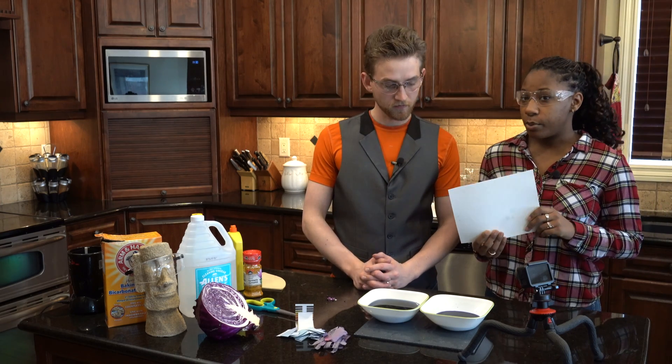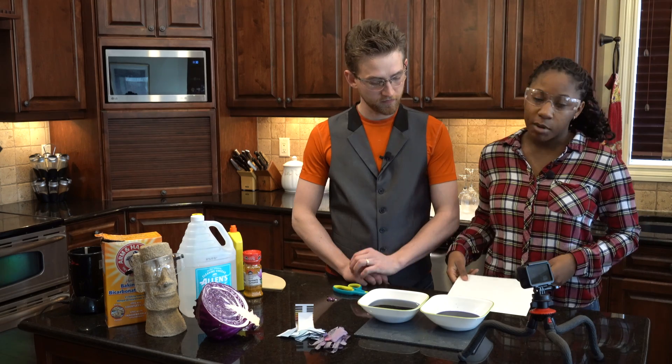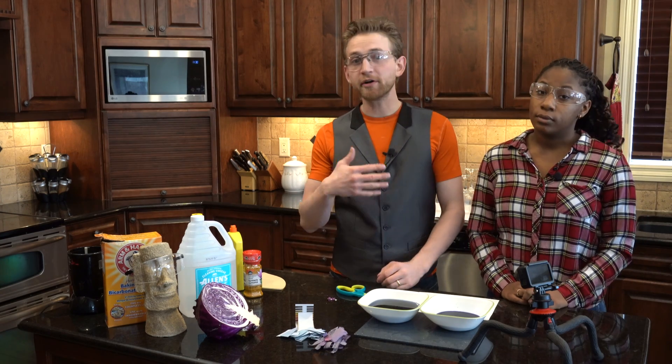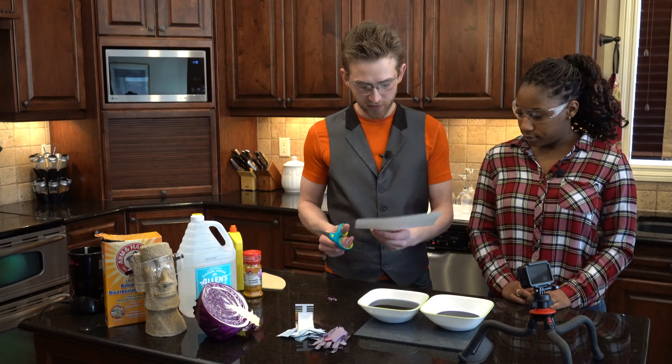We're going to cut the paper we brought into strips, and then we'll just drop them in and leave them until they're saturated. The longer you leave them in the juice, the more saturated they're going to become. So let's just go ahead and do that right now.